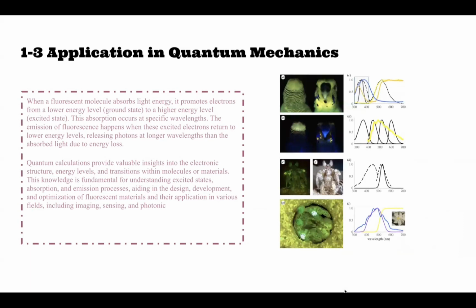This image on the right describes the fluorescence features of two different creatures, the bird and the crustacean. For the bird, it illustrates photos taken under white light and UV fluorescent excitation, showcasing fluorescent cheek and crown feathers. There's also an analysis of the reflectance and spectral sensitivities. The crustacean is depicted in a frontal aggressive display under white light and blue light excited fluorescence, along with images of the crustacean in its habitat under fluorescent excitation.